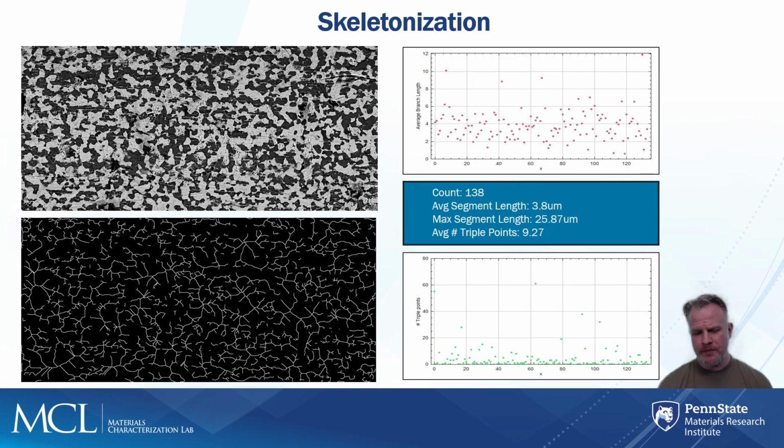So the next question would be, how do we get a handle on lengths of these various lobes and networks? One good approach in FIJI would be to skeletonize the network. That starts to give us a handle on segment lengths, number of triple points, and number of junctions, and it can be pretty useful. But it doesn't necessarily tell you what the longest lengths are going to be.